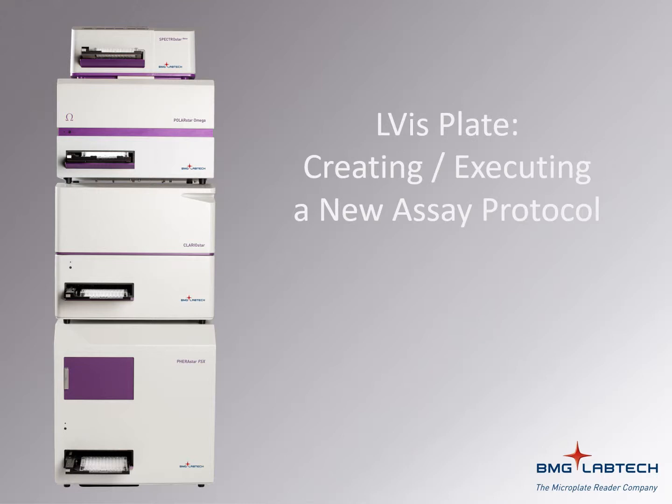Your BMG software comes with a number of default protocols for the LVis plate that we have found are suitable for most of our users. If you find that these protocols don't exactly match your needs, you can always create a new one. This video will give you an example of how this can be done.